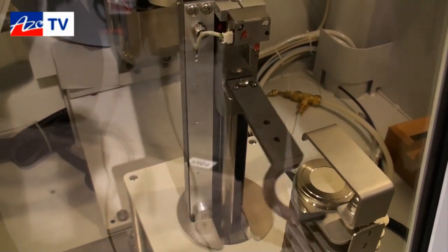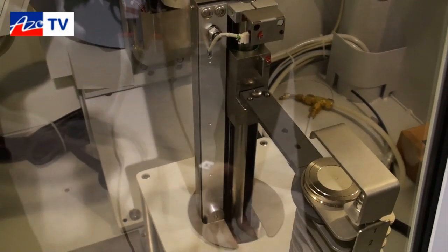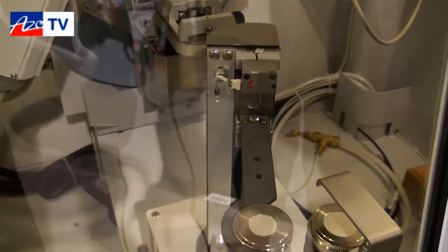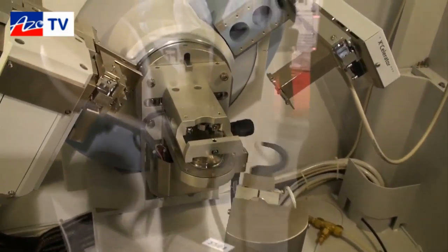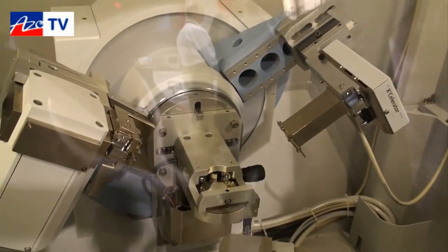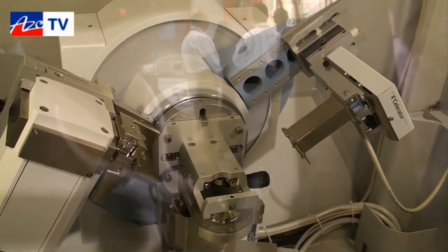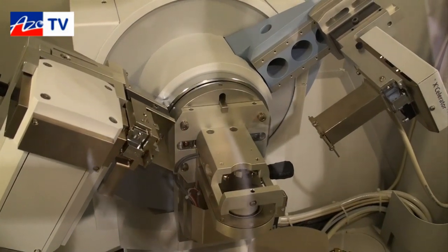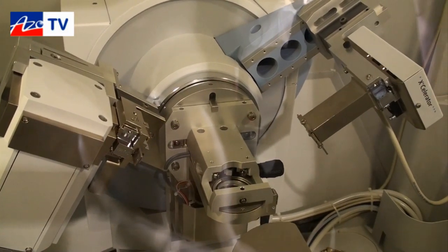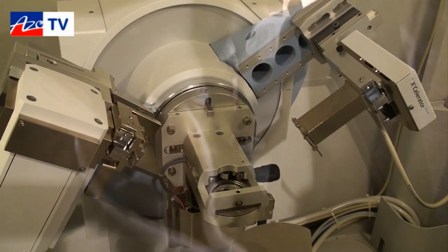The system is configured in a Bragg-Brentano geometry with fixed slits and our accelerator detector — it's a high-speed linear detector. We're actually celebrating our 10-year anniversary of the release of the accelerator. Back in 2001 here at Pittcon, we released that product, and since that time over a thousand of those detectors have gone out into the marketplace.